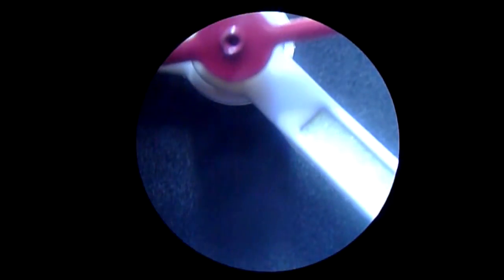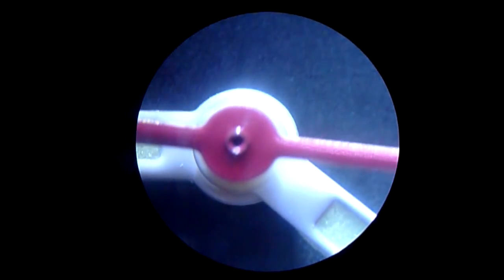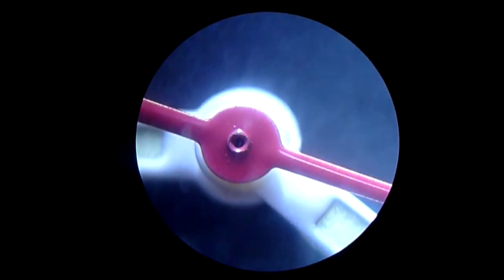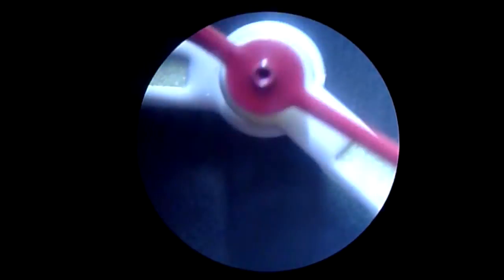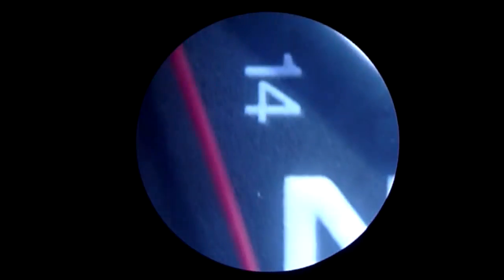I'll just move around a bit and see the hinge there. Everything looks so huge in this world, doesn't it? I'll show you something I've found, quite intriguing when I was fiddling around.